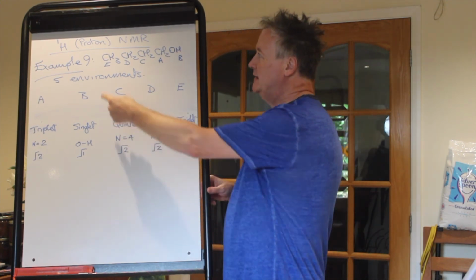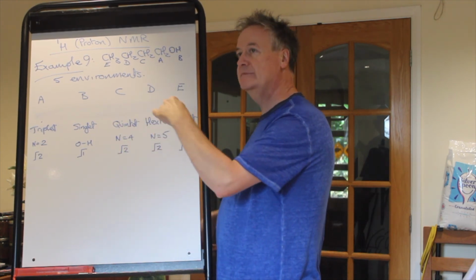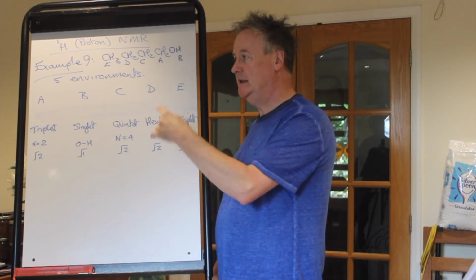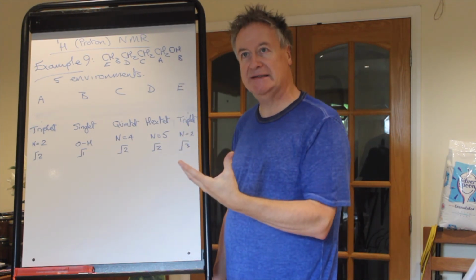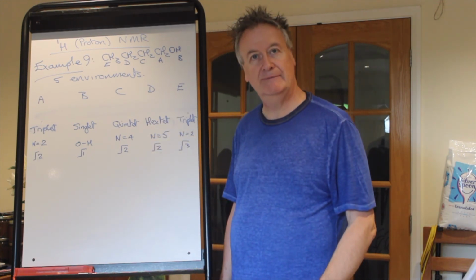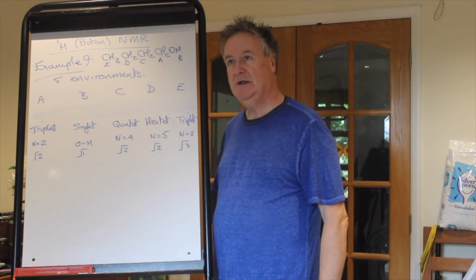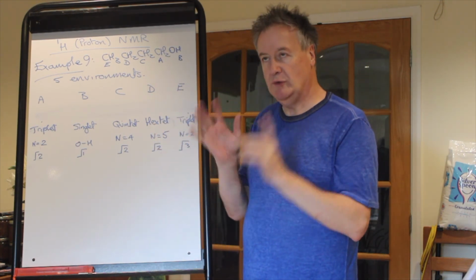So the process, if you propose butan-1-ol, is you go, it doesn't match what I'm seeing, I'll go for the simplest next isomer, which is butan-2-ol, go through the prediction and it would have come out correctly.